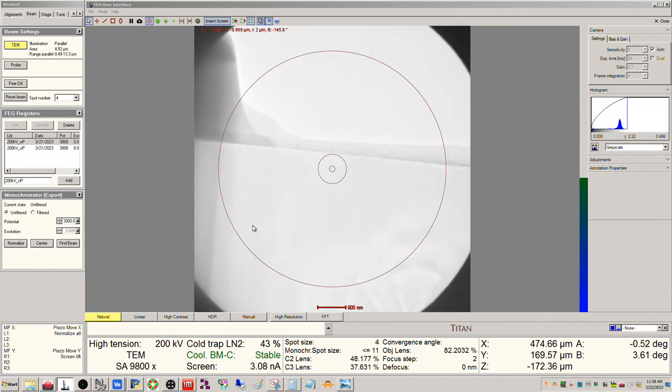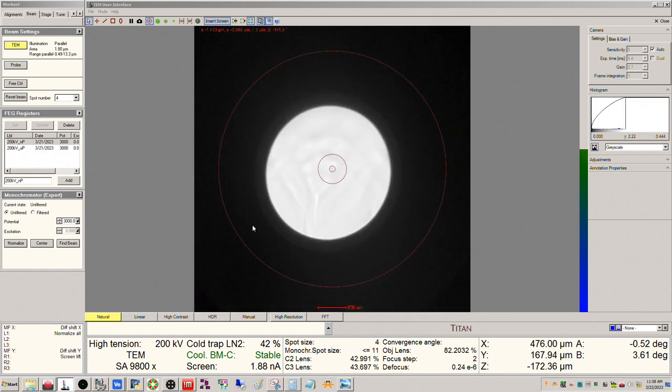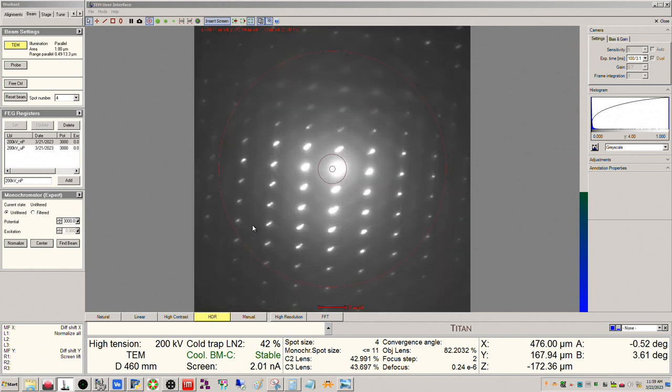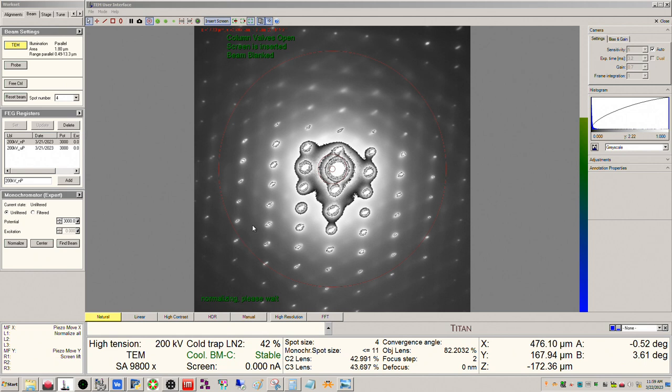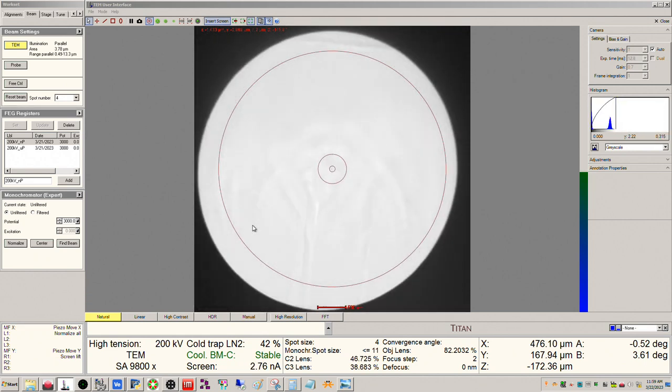When you have a spot where the zone axis alignment is good, usually you can see a confluence of bend contours. It might be somewhere down in here as well. Yeah, so it's getting kind of close there. This area is a little bit thinner, I think, than what we had. Might make more sense to try, well, I mean, let's try doing it from the spot we had set before, since we're trying to do this like it would be in real life.